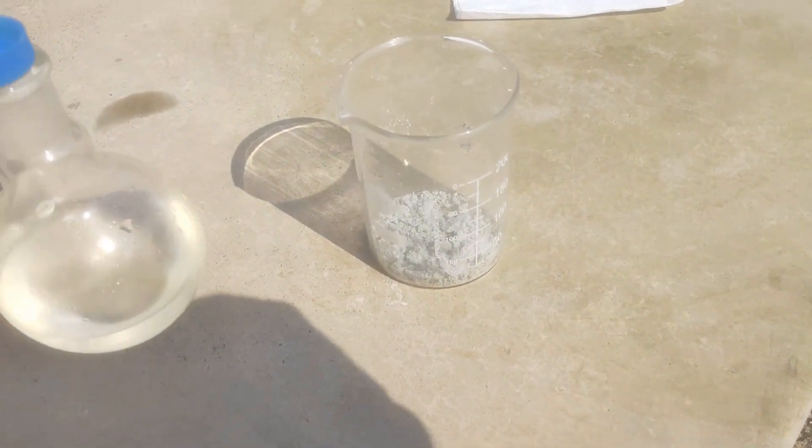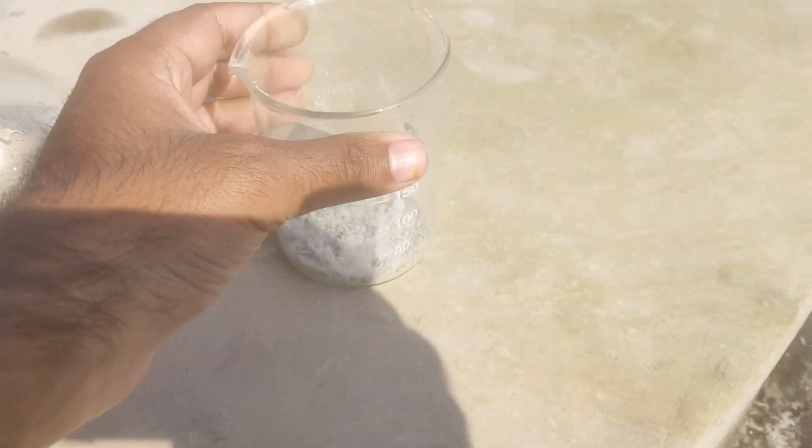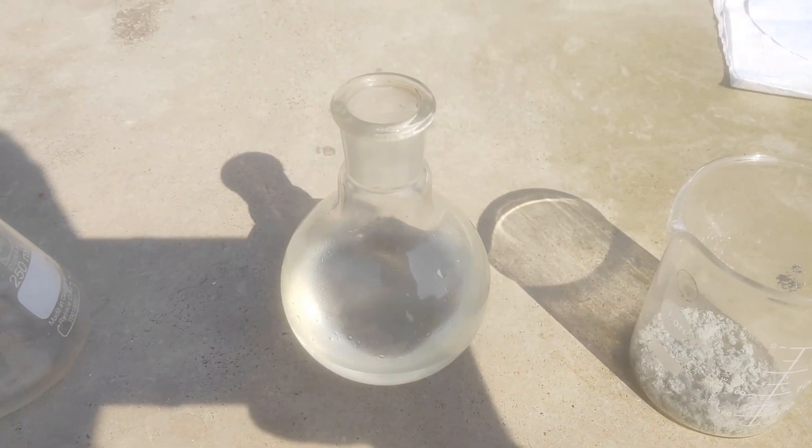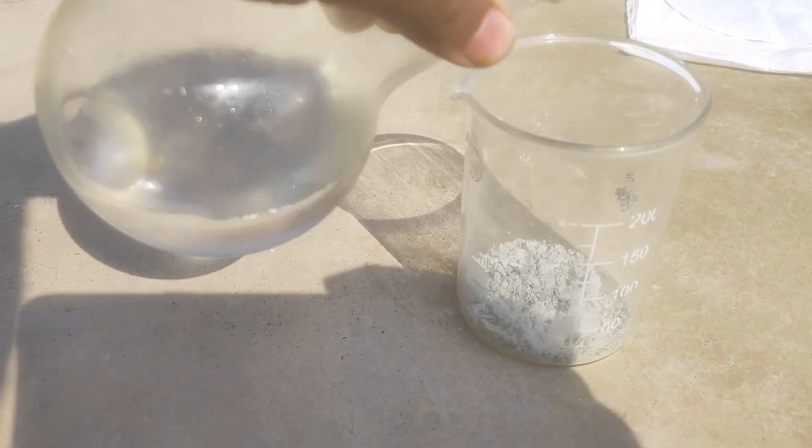The obtained filtrate is then reacted with clean distilled 20% hydrochloric acid, free from any iron or any sort of impurity that may cause issues in the plating process.